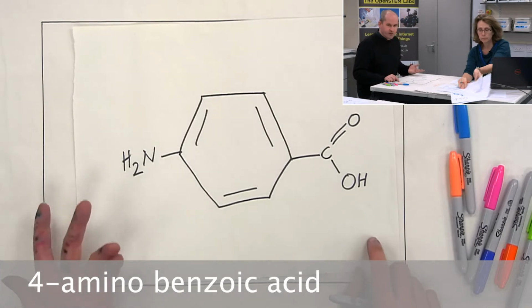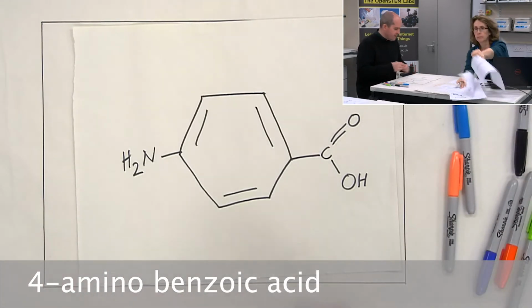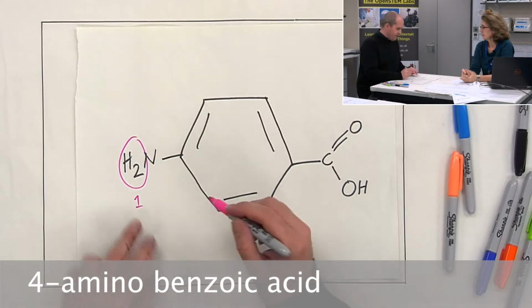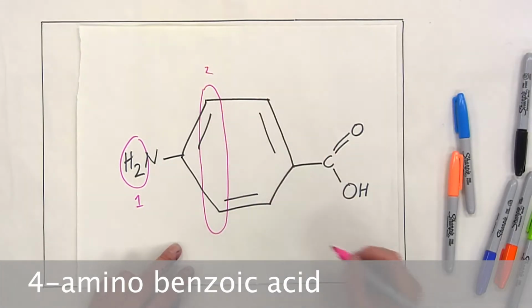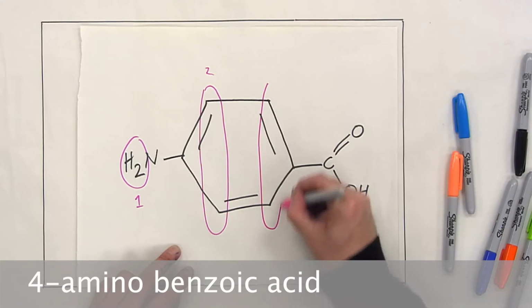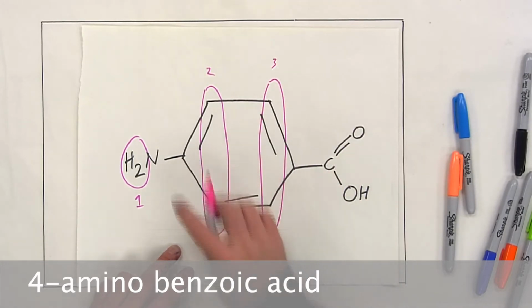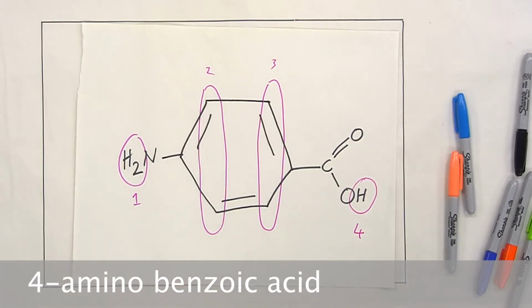So let's just first of all count the environments. So that's hopefully clearly one environment. The NH2s are one environment. It's a bit like the one we did before. That's a second environment. A third environment. There's obviously no hydrogen here or no hydrogen here. And then finally, there's a fourth environment. So we'd expect to see 4 signals or 4 resonances in the hydrogen NMR for that molecule.